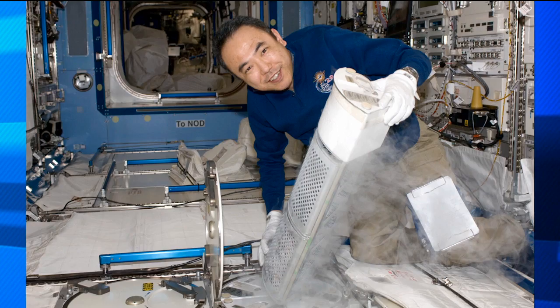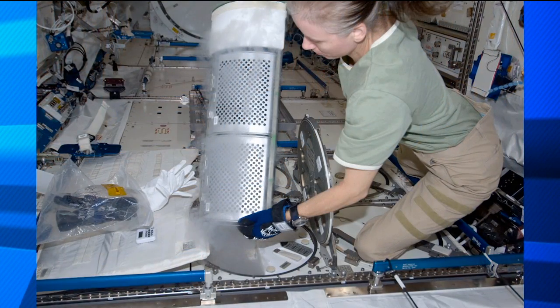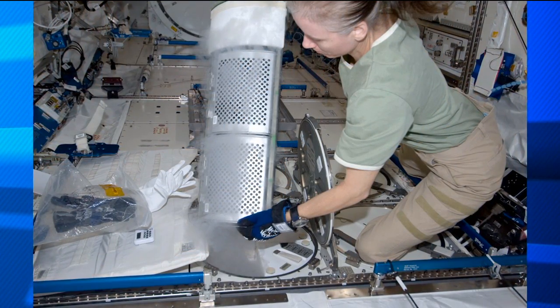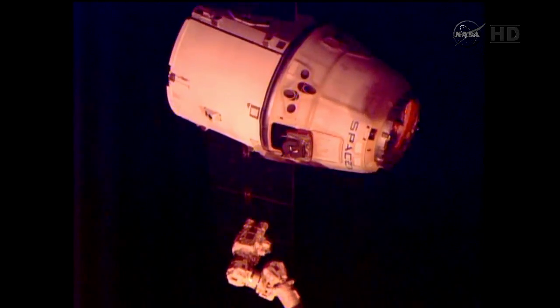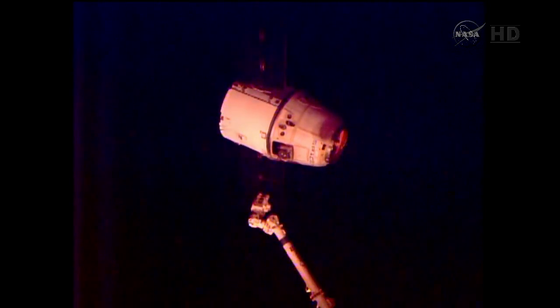This syringe part is what goes in the freezer, and it'll stay in the freezer on board space station until there's a SpaceX vehicle coming home. Realize that when they void into this bag, typically they collect three of these syringes out of that bag because this supports not only our experiment, but a number of other experiments. So we do take a little bit more out of each void.